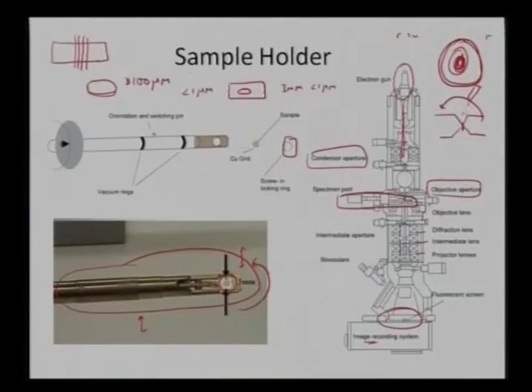So, I can see how critical sample preparation is: I need to make the sample big enough so that I can handle it. At the same time, some part of it, or the center part of it, has to be transparent to electrons, so that I can visualize, observe or analyze the region in that regime. That is the overall idea of sample preparation in the transmission electron microscope. Once my sample is ready, I insert it in the TEM holder, the transmission electron microscope holder, so I can observe it further.